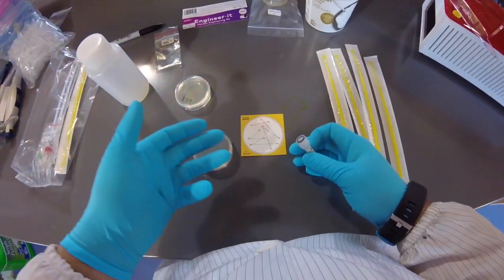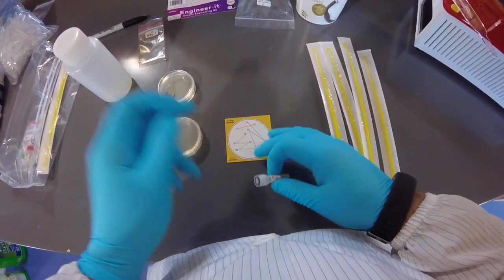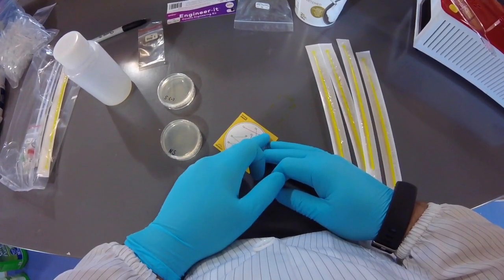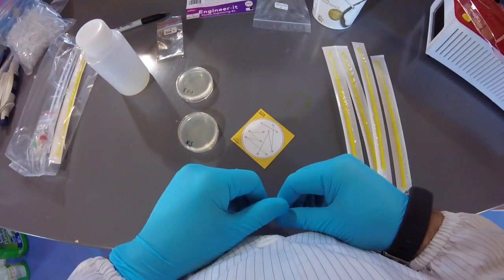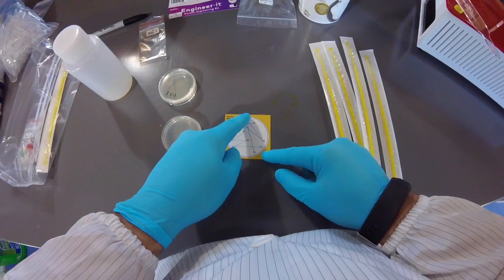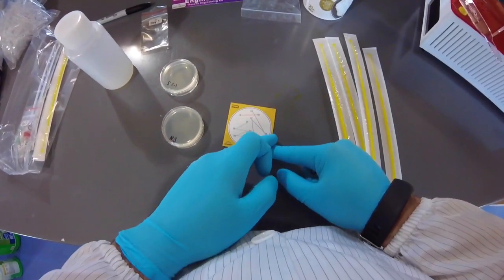In order to get these colonies rather than a lawn, we're going to do a streak method where we dip a loop into the cells, and then spread it onto the Petri dish on this line 1, okay? Then we're going to discard that loop and get a new clean loop. With that clean loop, not dipping it into the cells the second or third time, we're just going to rub through the first line and do another zigzag. We're going to throw that loop out, get another loop, and do the same thing.